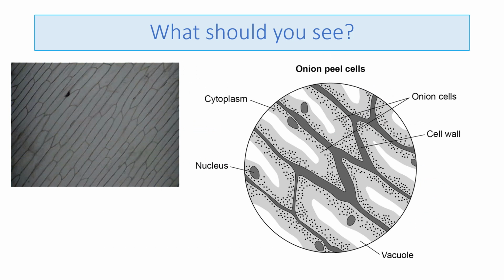If you see a diagram or an image from a microscope slide, the likelihood is it will be based on onion cells, which is what you would have used, and the image is something like this. So you can see here on the lower magnification, your diagram, that would probably be the best you could see. And if you were to look really close, you might get to see some of those things. But how do we represent this?